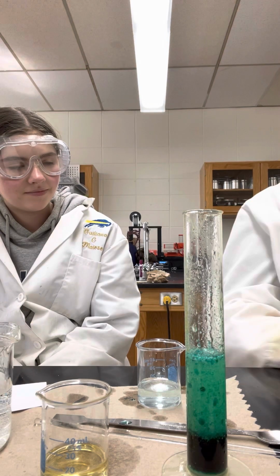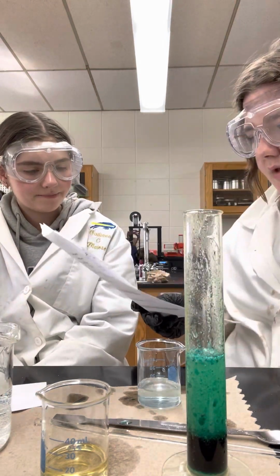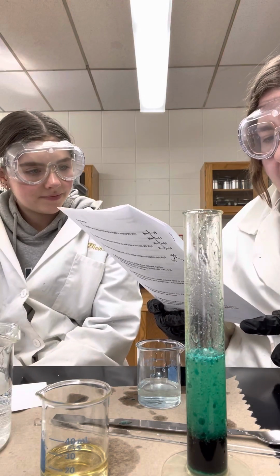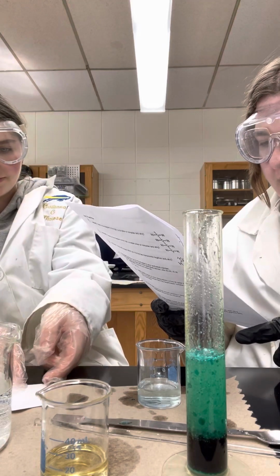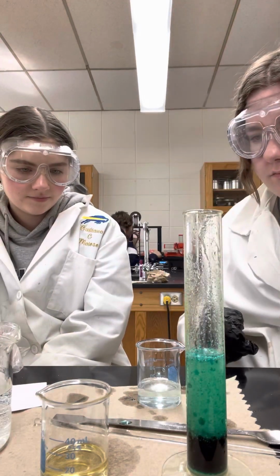Perform. Add 0.5 grams of salt to both beakers, 0.5 grams each, and stir them.